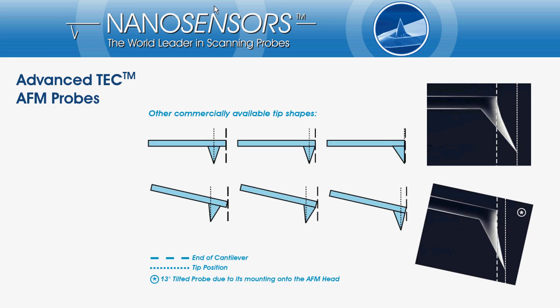Even the tetrahedral tip at the end of the cantilever is not visible anymore. The two SEM images at the right hand side are showing the Advanced Tech unmounted and mounted onto the AFM. Only the Advanced Tech tip is protruding that far over the end of the cantilever that even when tilted the tip is still visible.